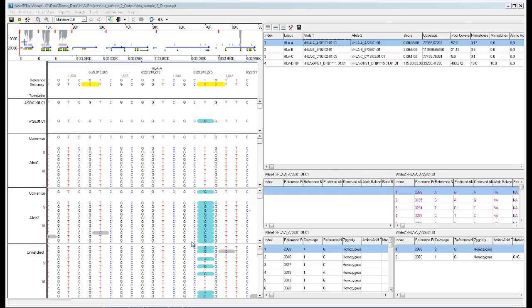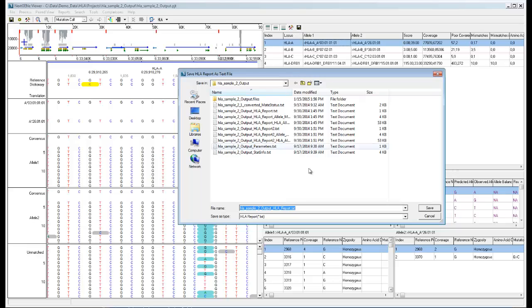The HLA analysis results can be saved by clicking the save icon, which will save a text file for the HLA report, including all three parts of the report.